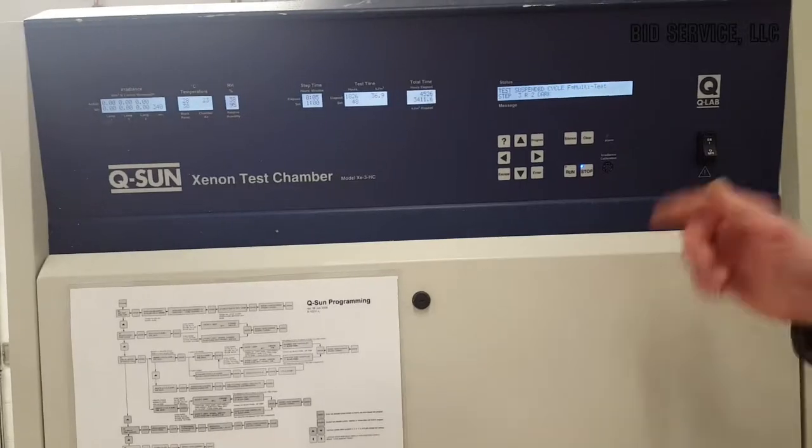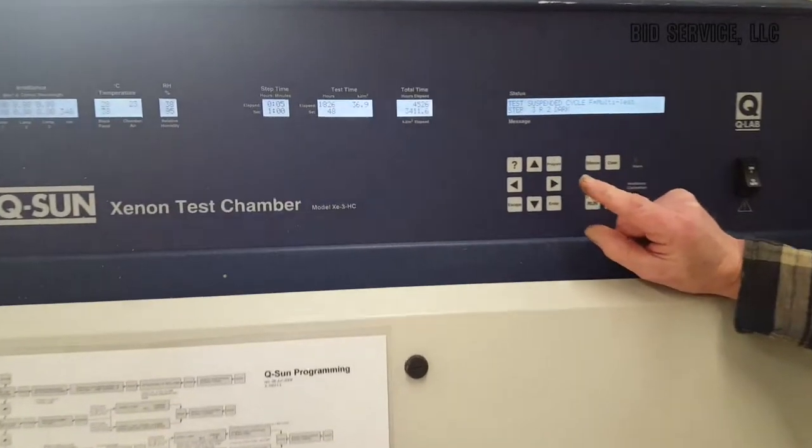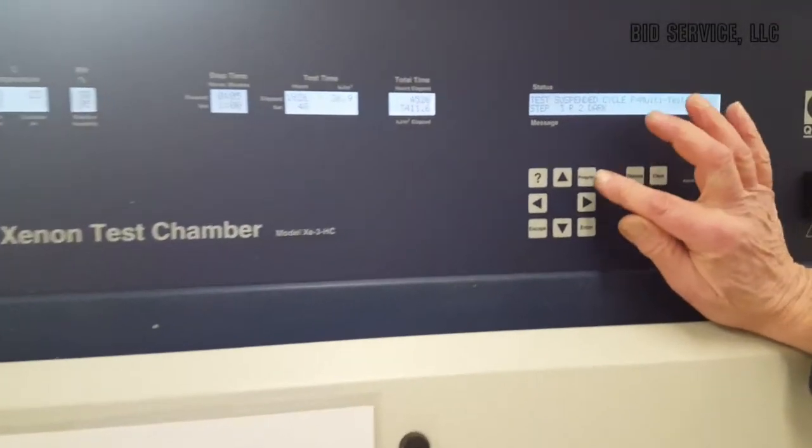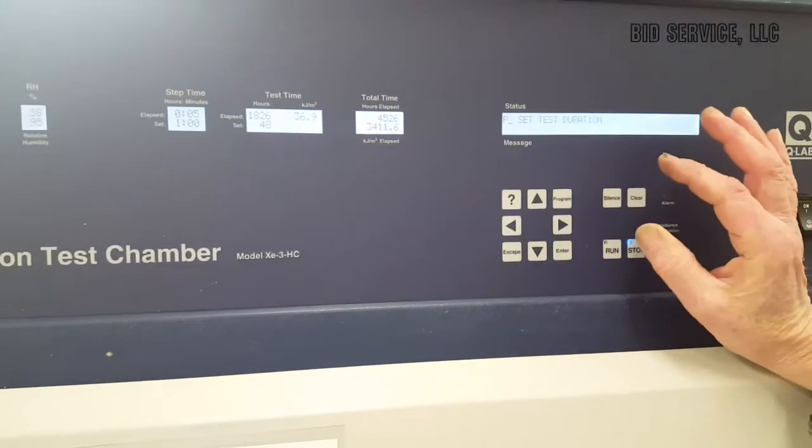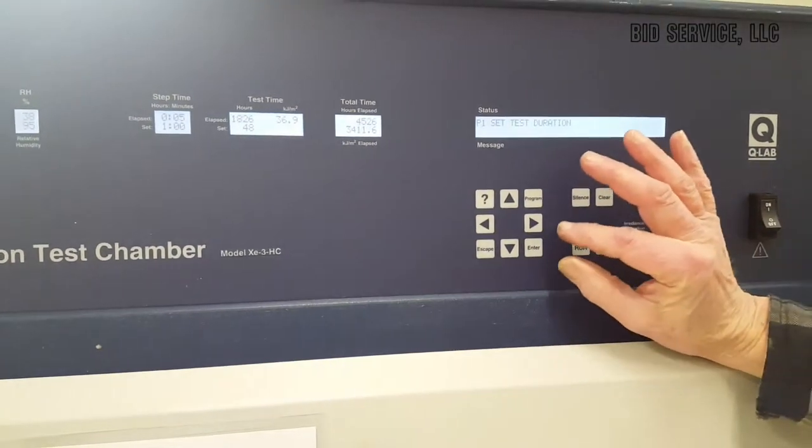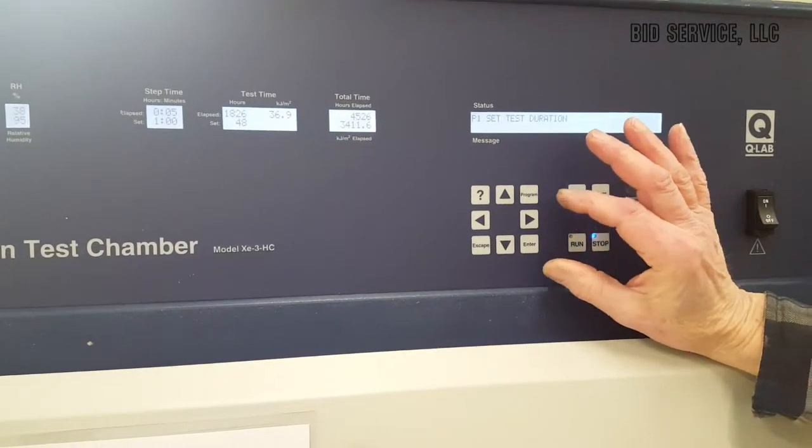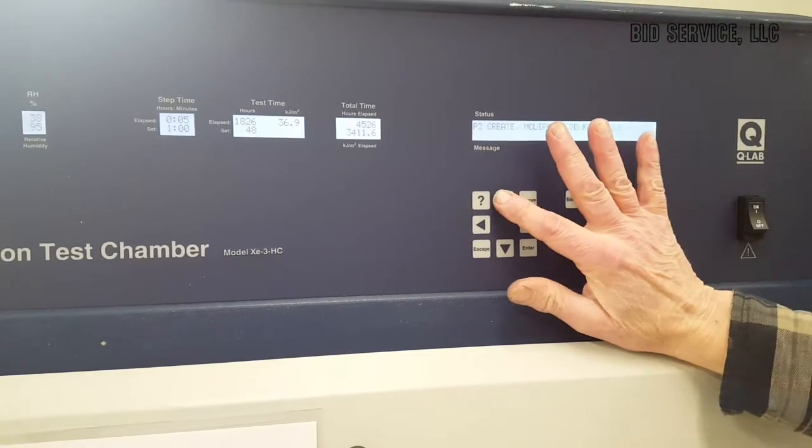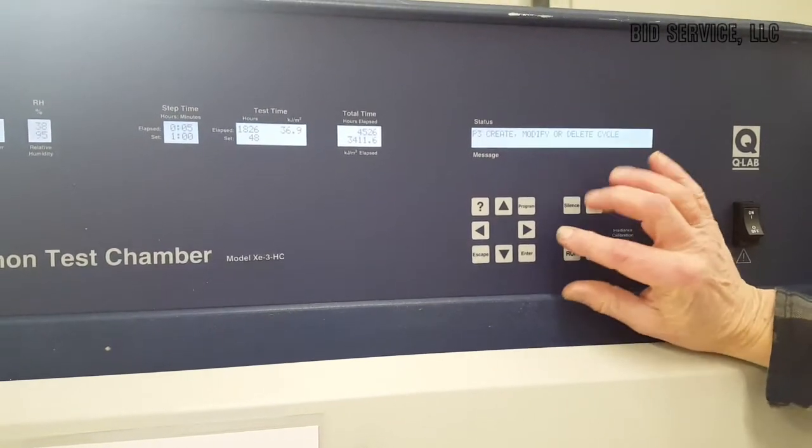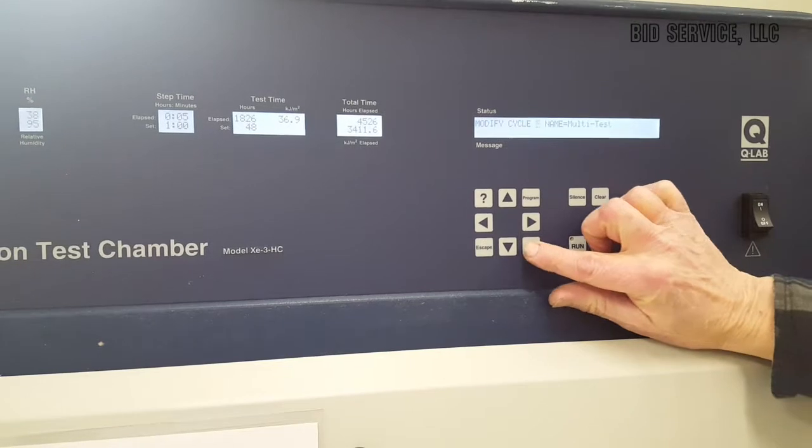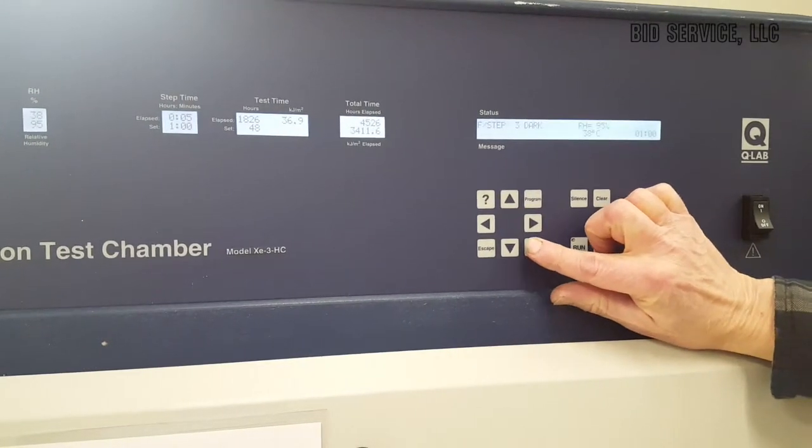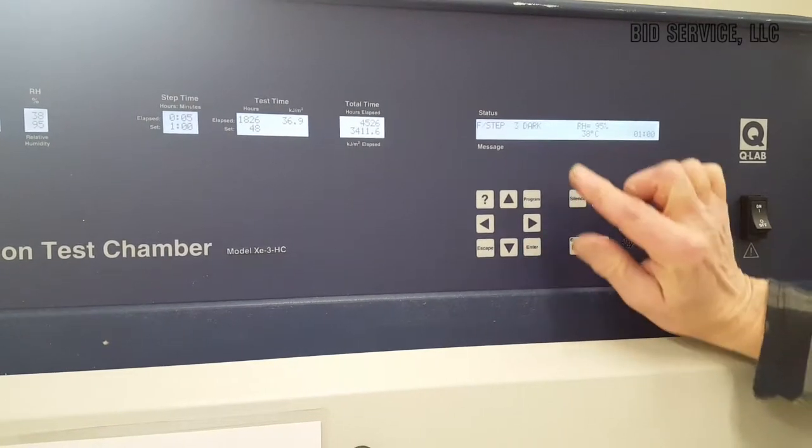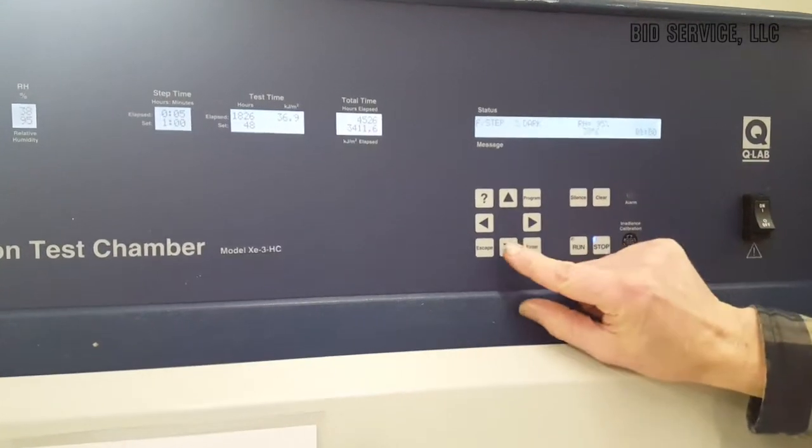Okay, I'm going to run a different version of the same test. What I'm going to do here is I will just go back into it and show you folks. I'm going to go in there. And as you can see, I've changed this.